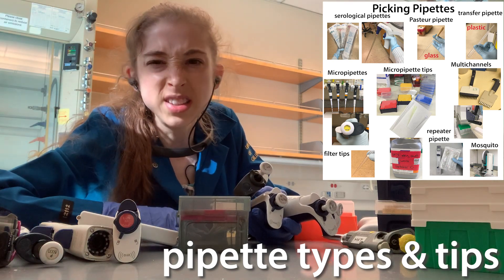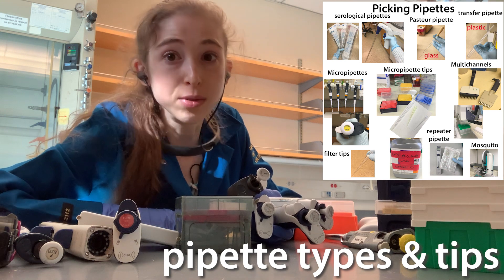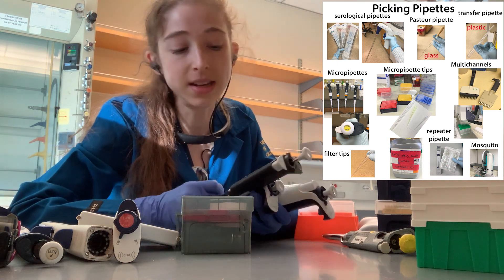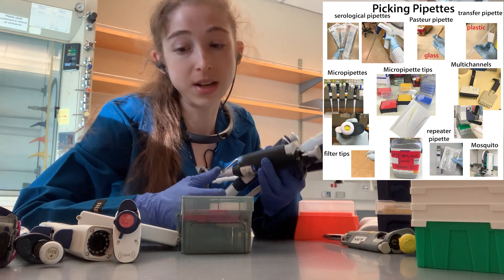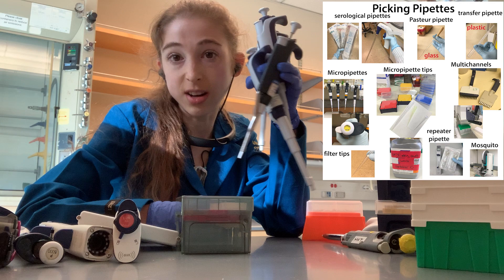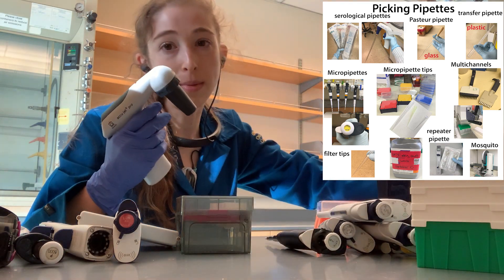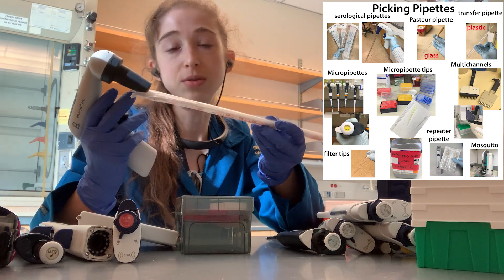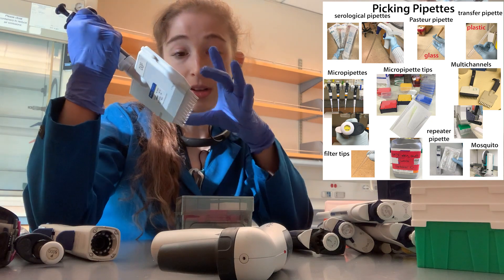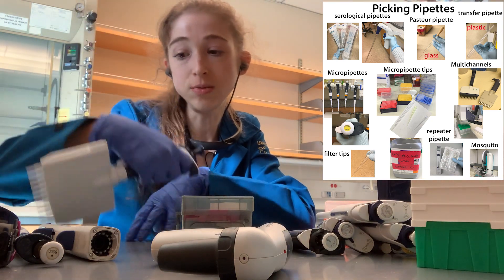Let's talk tips — pipette tips, and pipettes themselves. If you go into any sort of biochemistry or molecular biology lab, you're going to see a lot of pipettes in a lot of different forms. We're talking about micropipettes, which are go-to tools, pipette-men which can do bigger volumes, and multi-channels which will allow you to do multiple ones at once.